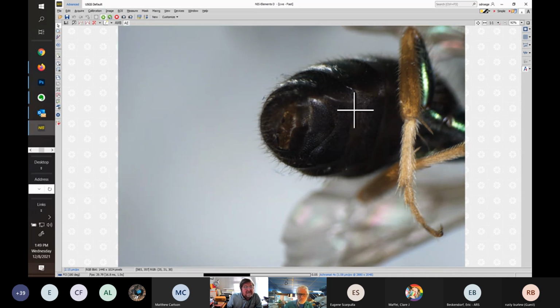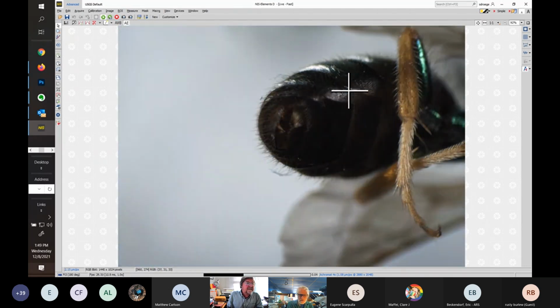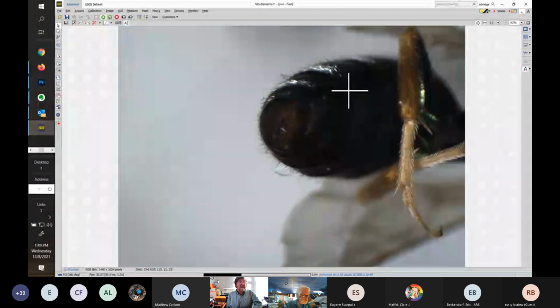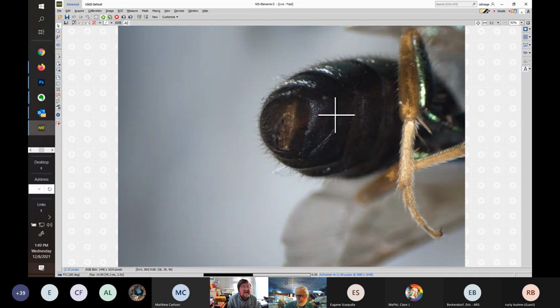Let me get this out of the way here. And try and play with the lighting so that maybe from this direction. It's hard because everything's dark. I mean, I think that's clear. Yeah. Clear. There we go. That is quite dipped. I actually hadn't noticed that one. That's a good one. Add that into the guide.